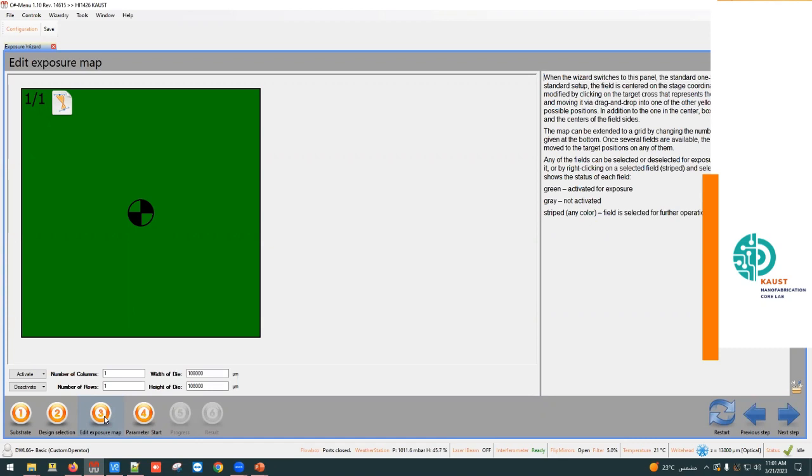I will explain further later, because for now I'm going to give you the standard parameters for mask fabrication. But if anyone wants to expose with a different photoresist or a different substrate, we will need to adjust the process.